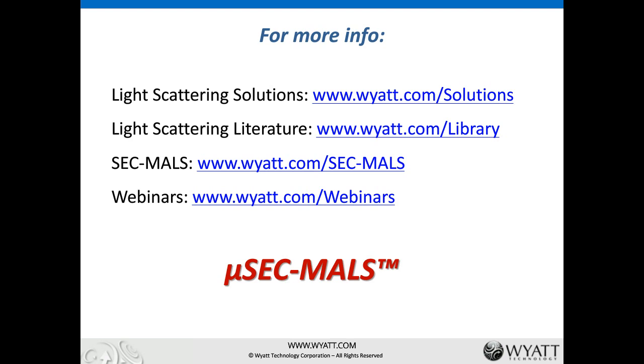Okay. For the NIST mAb, could you resolve the different masses of the 3 to 4 high molecular weight species that were present? Great question. We could definitely resolve the dimer, as you can see in the presentation. We could resolve almost a trimer, but anything higher than that, because they are quite gobbled together, we couldn't really get very flat or well resolved molar mass results. If in the future the different species can be resolved better from the SEC column, then most likely we'll be able to resolve those species. So this is not a limitation of light scattering, but rather the separation of the different species.